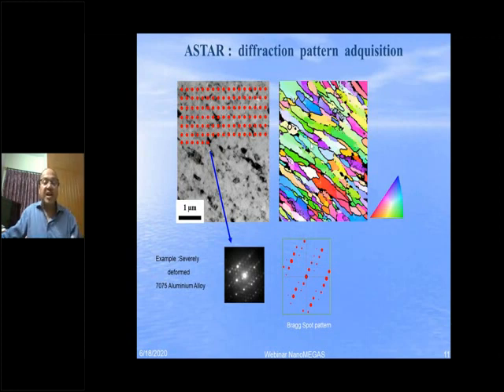So how it is done, I think Partha has explained, but just to complete it, it is done almost like an EBSD, but in a slightly different way. At each dot we wait there and take a pattern like this. This is called an electron diffraction pattern. I think those who do TEM know that. We move to the next dot, we take a pattern.